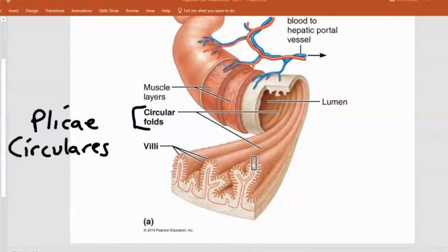And it's pretty neat because look how it comes in and it makes ridges in there. So what they've done is they've zoomed it out here so we can see that each of these folds get these little tiny, looks like a little tip right there. And each of these looks like it pushes, so it's like little fingers pushing up. So on the ridge, it's got thousands of little finger-like structures. And they're all independent, not connected, and they could separate from each other, okay? That means they have an amazing surface area. Surface area is contact area with the outside world.